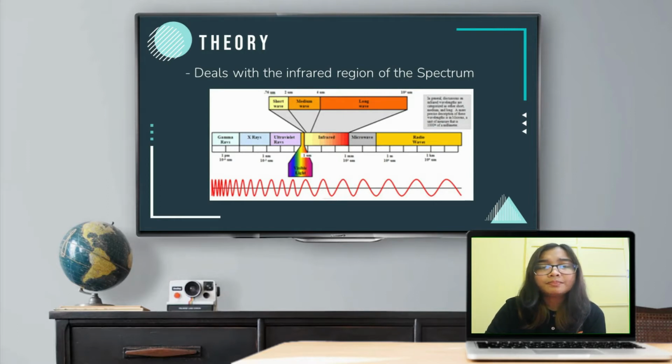The absorption peaks within this region are usually sharper when compared to the absorption peaks from the ultraviolet and visible regions. In this way, IR spectroscopy can be very sensitive in the determination of different functional groups, since different functional groups absorb different particular frequencies of IR radiation.